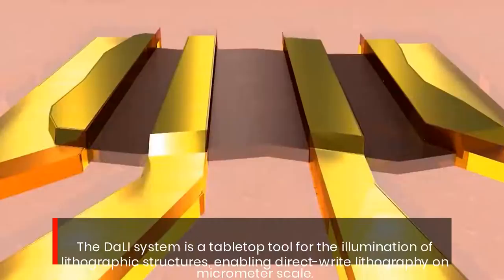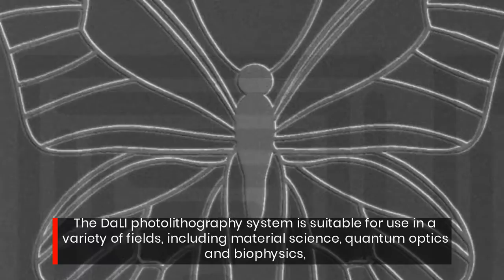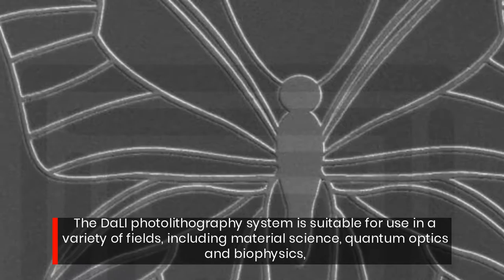The DaLI system is a tabletop tool for the illumination of lithographic structures, enabling direct-write lithography on micrometer scale. The DaLI photolithography system is suitable for use in a variety of fields, including material science, quantum optics, and biophysics.